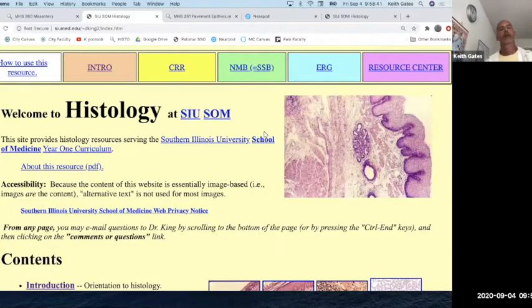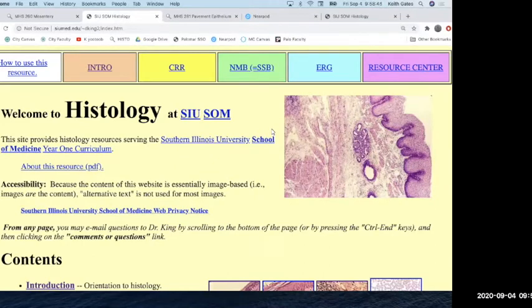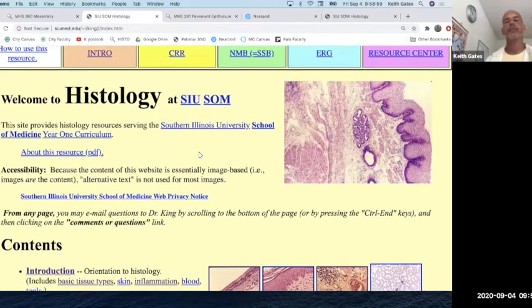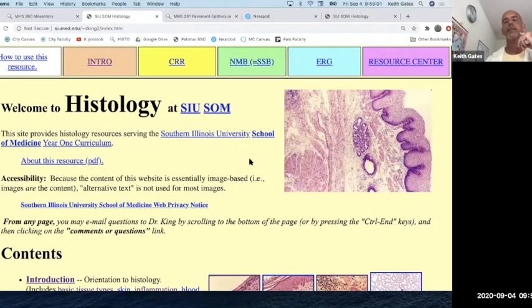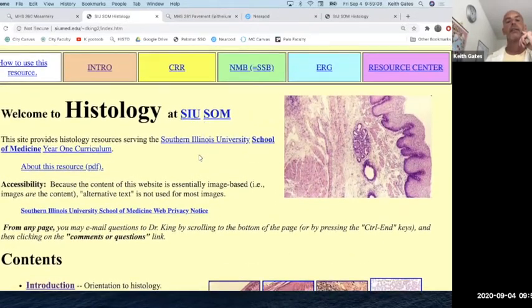Welcome. Today we're going over connective tissue histology, which will be with us for the entire course, so it's best to get this down now. If you want to go the extra mile, buy the Michael LaBoff book — it's a good thing to get. But this site here, Southern Illinois University School of Medicine, will kind of replace that. It's pathology-centered and has great descriptions.